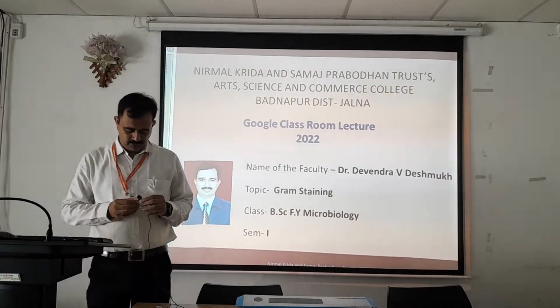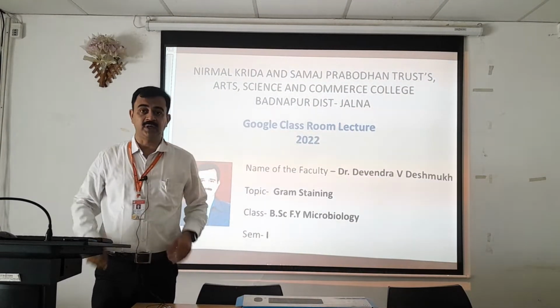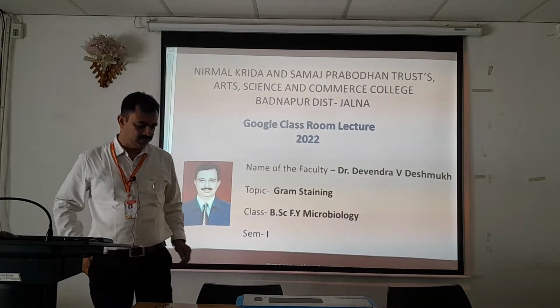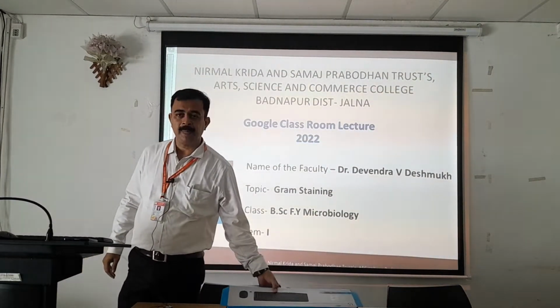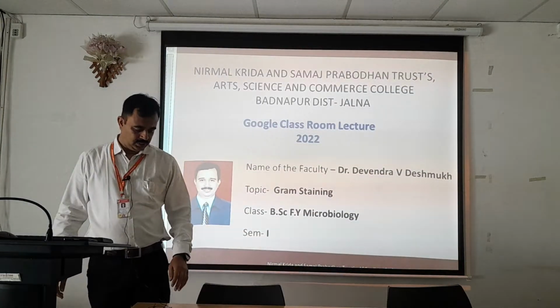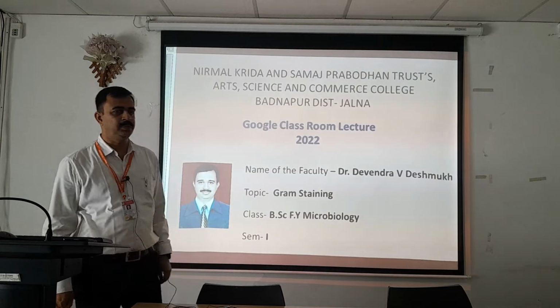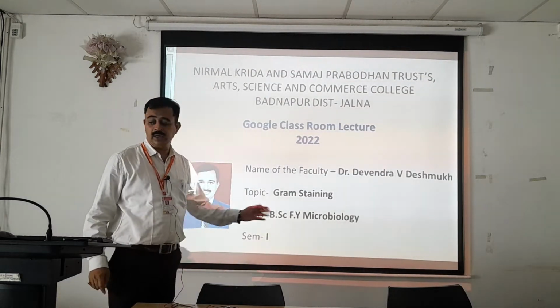Good morning to all of you, and I am back again with another lecture which is based on staining methods. We have seen negative staining, monochrome staining, and acid fast staining in my last lecture, and today's lecture will concentrate on an important point, that is gram staining.